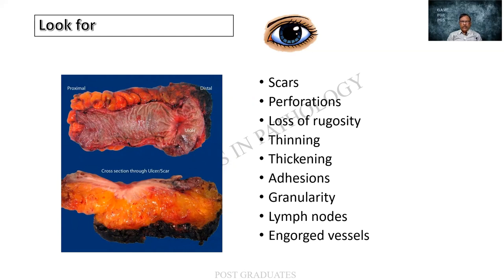And going back to the earlier slide, the right side is supposed to be more capacious and it will be an ulceroproliferative or a proliferative lesion. I told you that the differential diagnosis can be hyperplastic tuberculosis. On the left side, it is more constrictive, as a result of which the patient will develop symptoms of constipation, and the diagnosis will be much earlier. Therefore, the left side is supposed to have a better prognosis. But that is all old story.